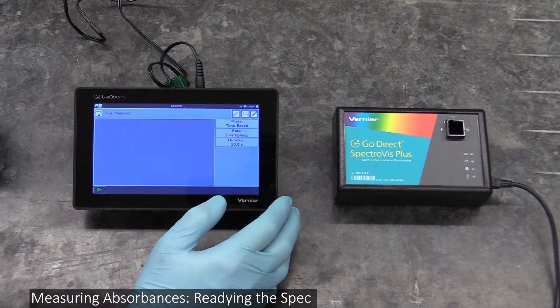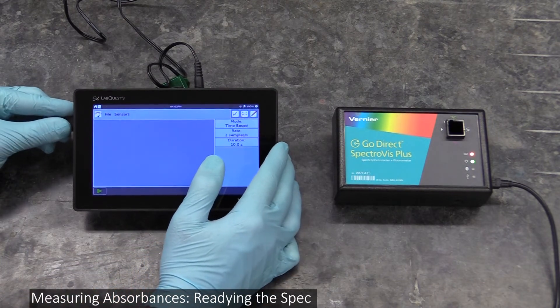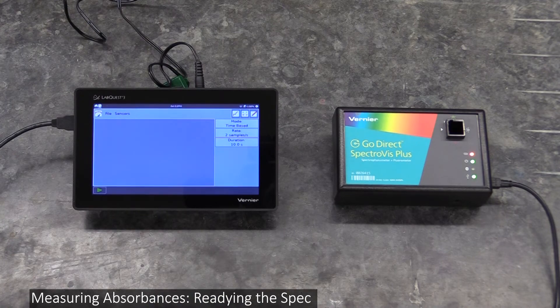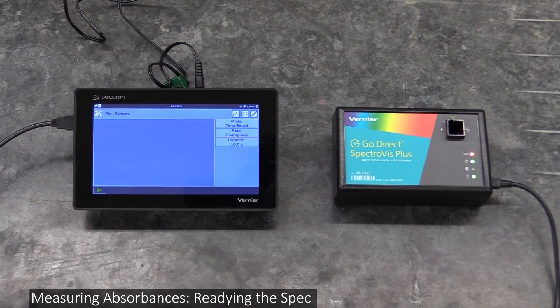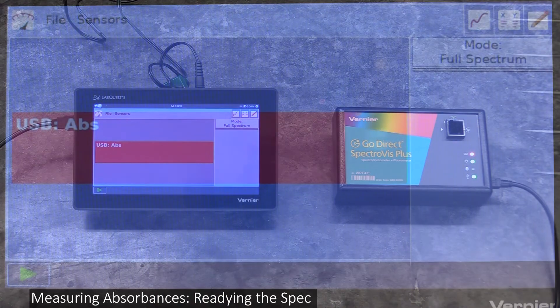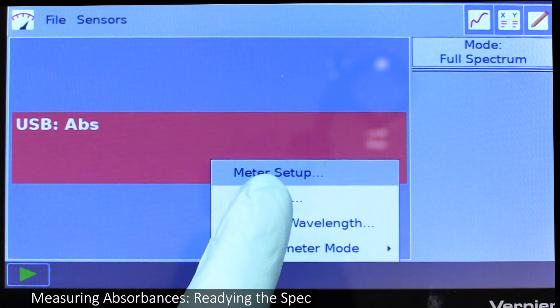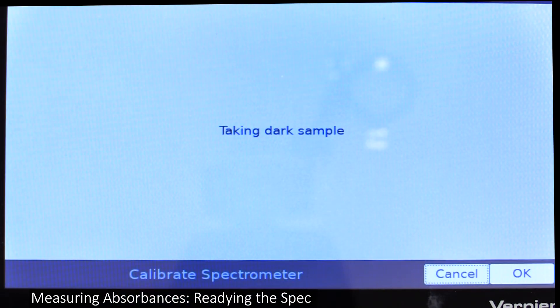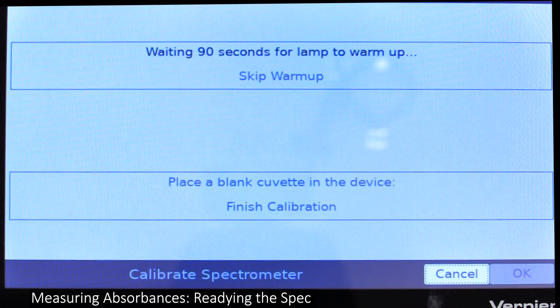Next, connect the spec and computer together with the USB cable. After a few seconds, the computer will figure out it's attached to something, and you'll get a big red box on the screen. Click on the box and select calibrate. You'll get some message about a dark sample, then a countdown timer will start for the lamp to warm up.